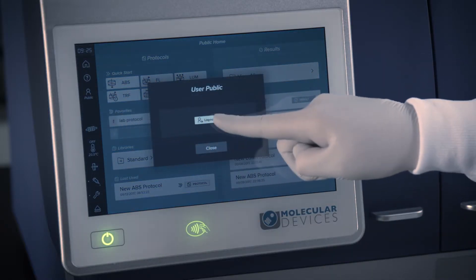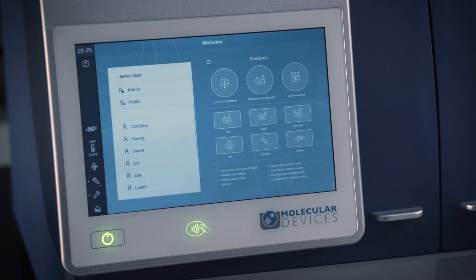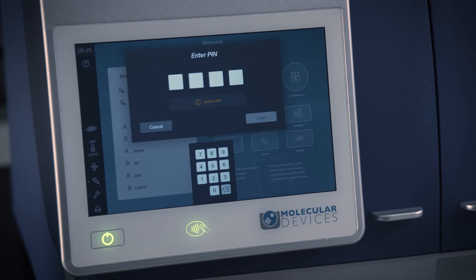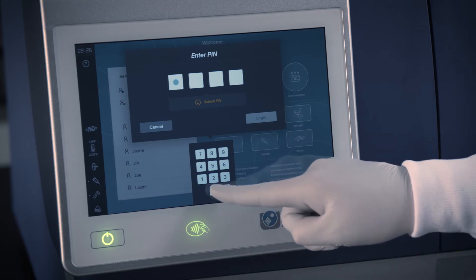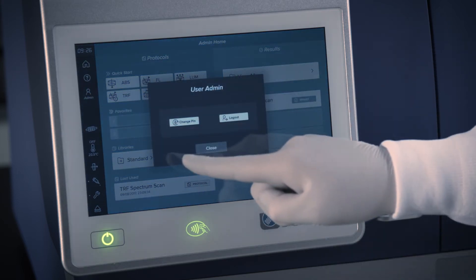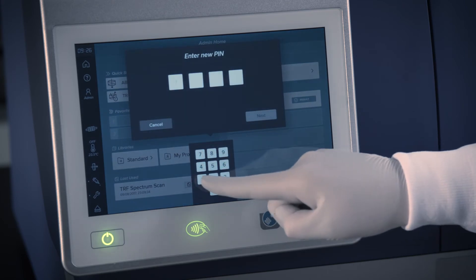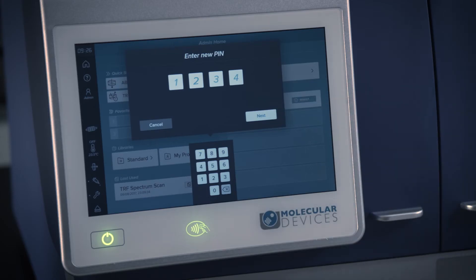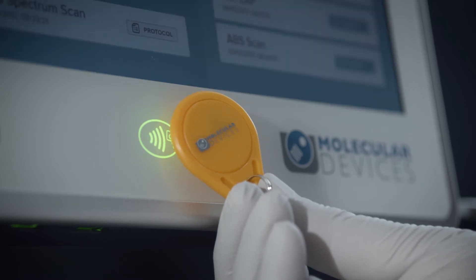The admin may set up multiple user accounts that can be protected by a PIN and/or NFC tag. Once you decide on the ID Reader's admin, login with the default PIN 0000 and then touch the admin user icon to enter a new PIN. Only the admin can create new users, require users to log in with a PIN or an NFC tag, and reset PINs.